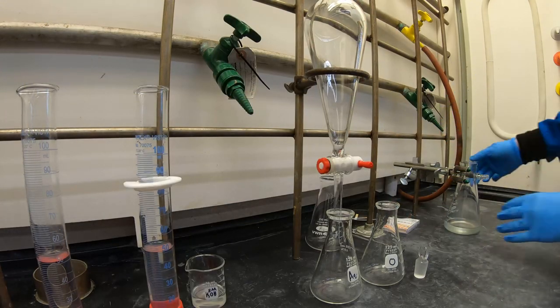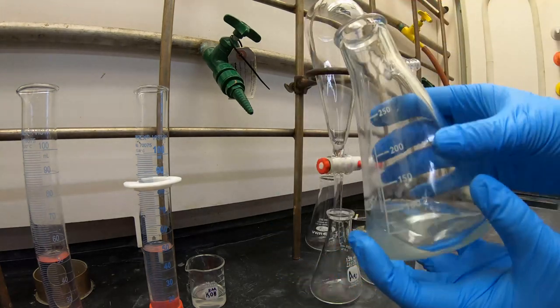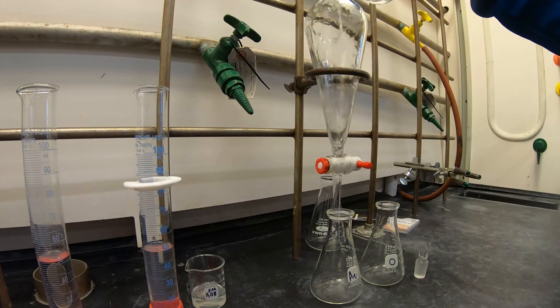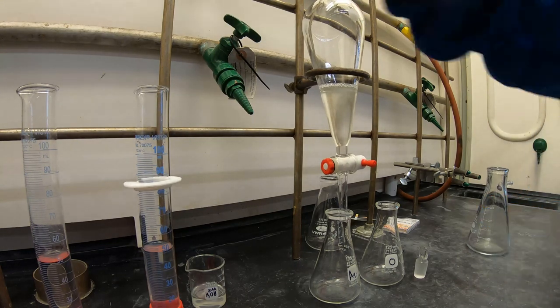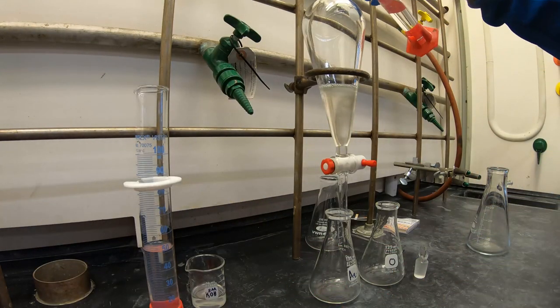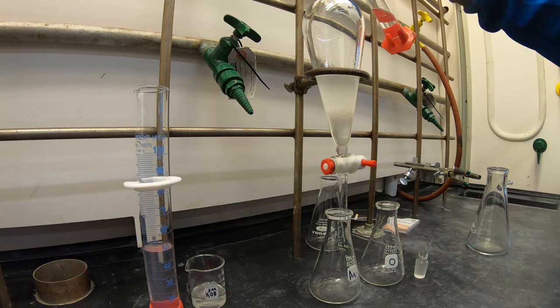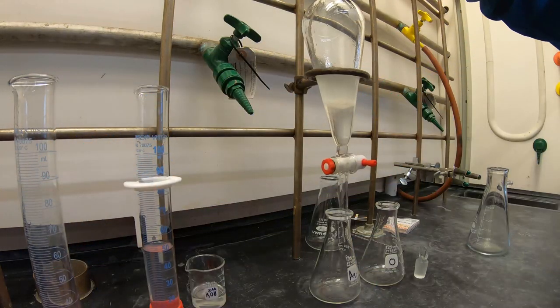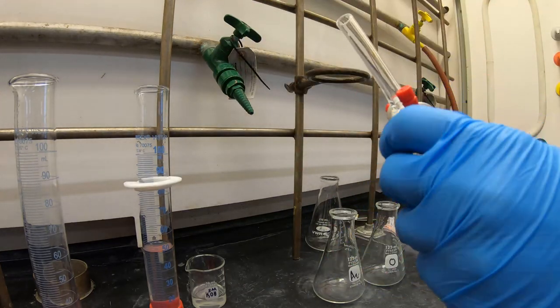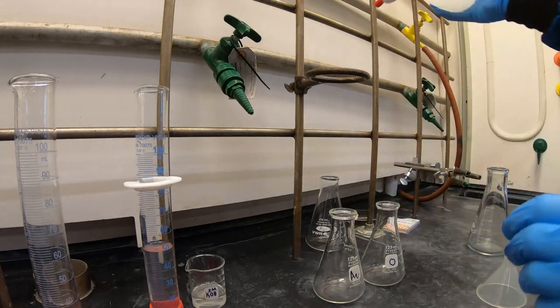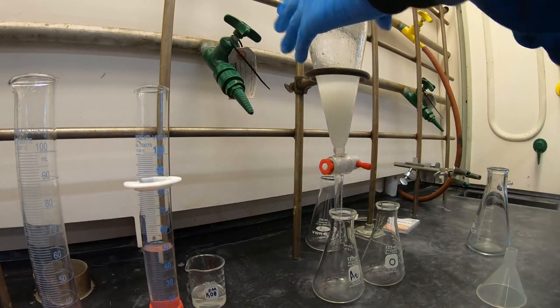Set up a separatory funnel, then transfer the toluene filtrate to the funnel. You're going to wash this twice using 25ml portions of 3 molar HCl. If you recall the toluene density, you'll realize that the organic layer is on top. Since you're using acid today, be sure to vent during shaking.